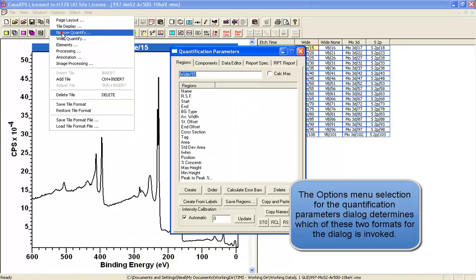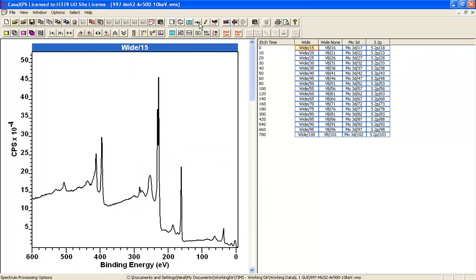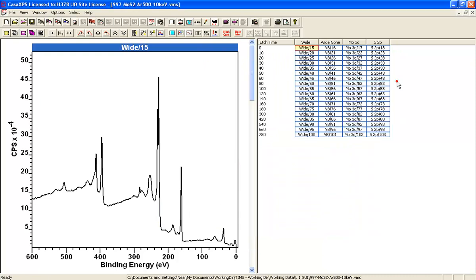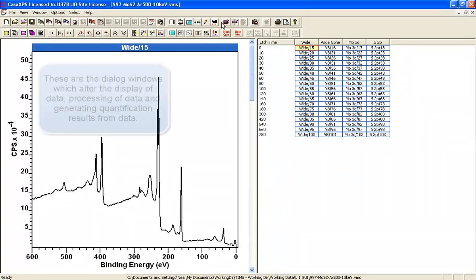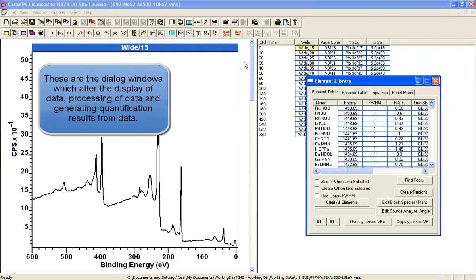So I will return that to the narrow one. You have again the spectrum processing dialog window, annotation, and also the element library. These are the main functional components of the software for managing data in the left-hand side and obtaining results from these data.